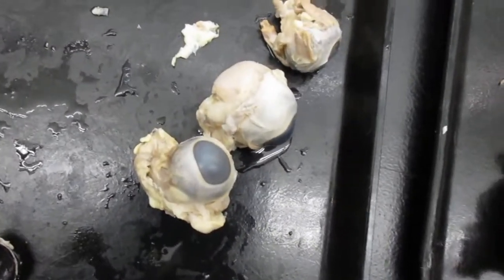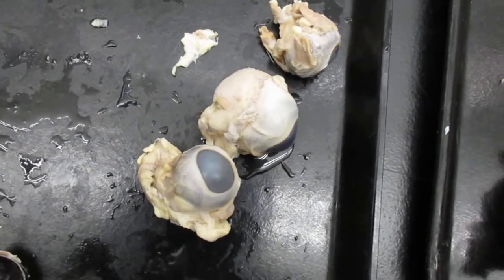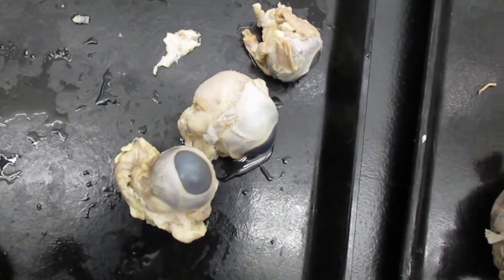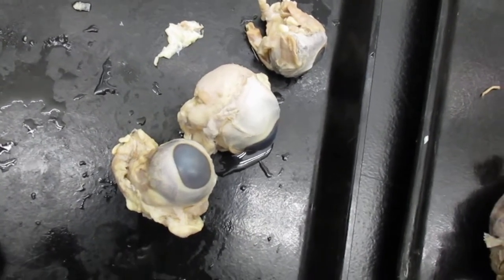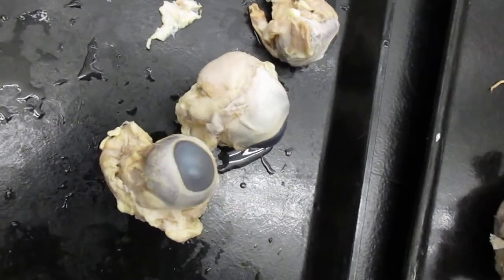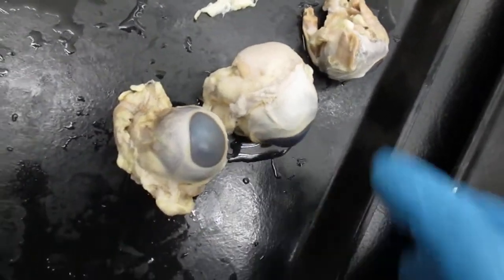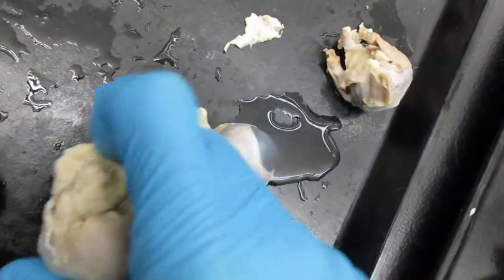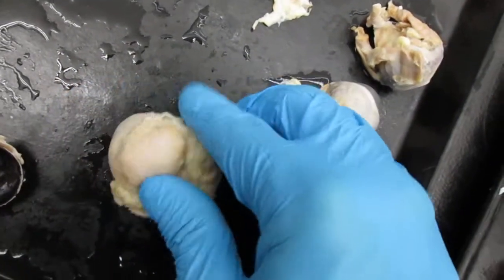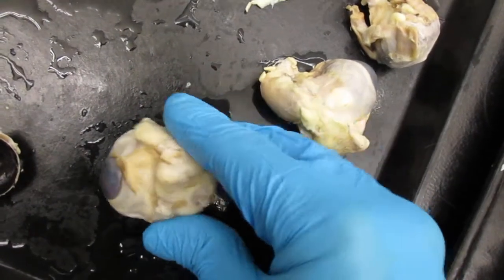Let's talk about the sheep eye. If you notice, your eye is going to be in the orbital cavity, and it's going to be surrounded by fat. So there's lots and lots of fat associated with the eye. Here is one sheep eye that hasn't been touched right here, and we see there's a lot of fat.